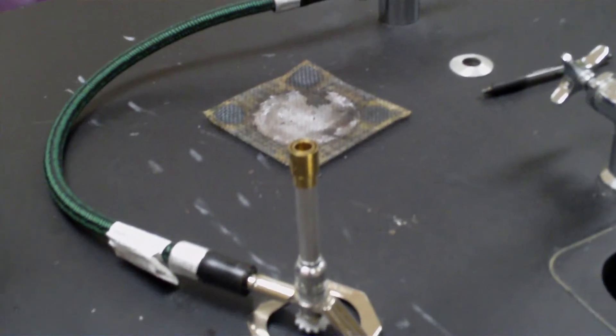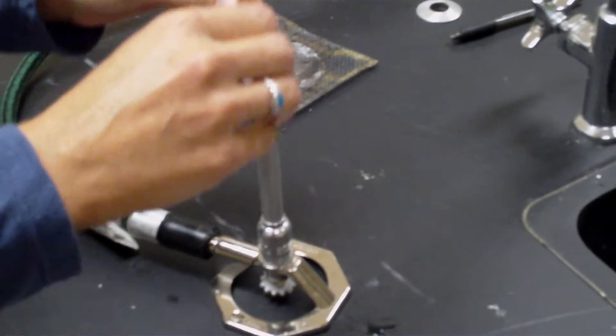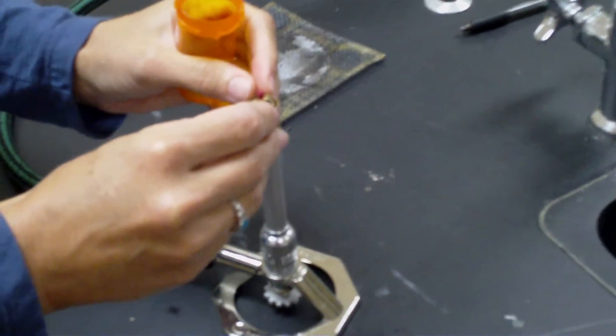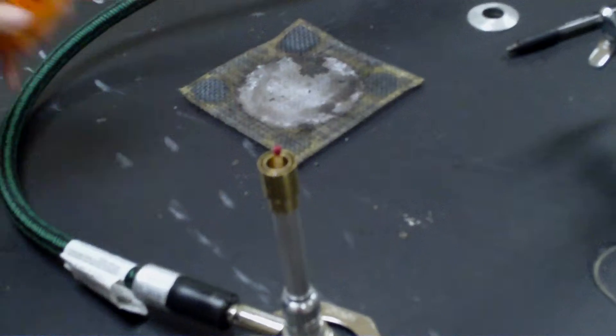And the last thing we're going to do is put a pin in the center. Put the match in the center of the barrel, and we're going to relight it.